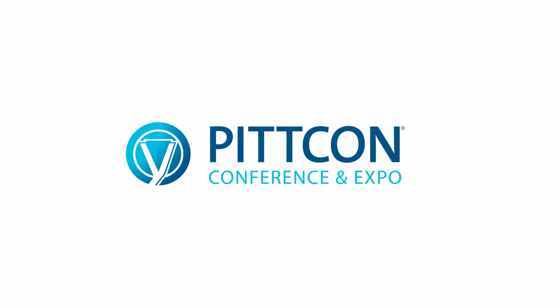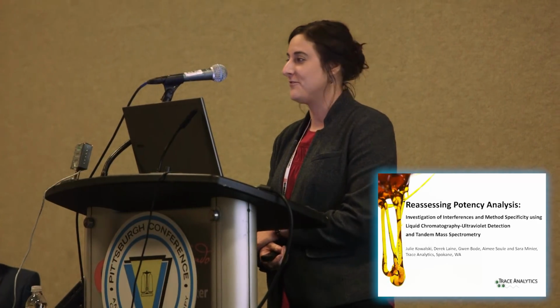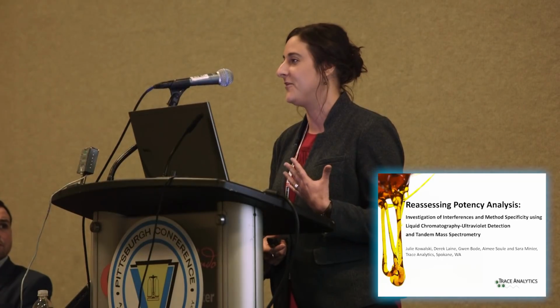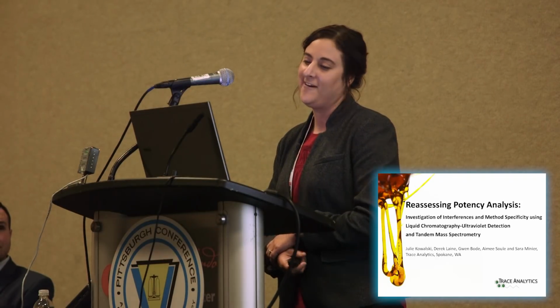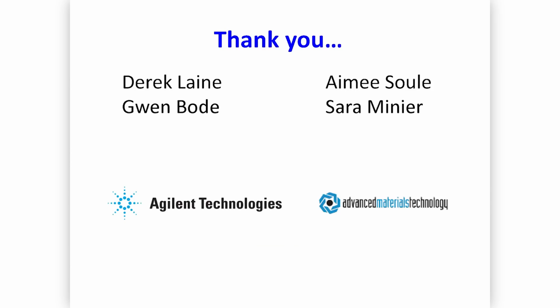So the title is called Reassessing Potency Analysis. And for me, to be honest with you, this is kind of assessing it for the first time. Anyone that knows my background knows I've been doing pesticide and chemical contaminants for quite some time. So this was kind of a new adventure for me, to actually do UV analysis and do something other than trace level analysis.